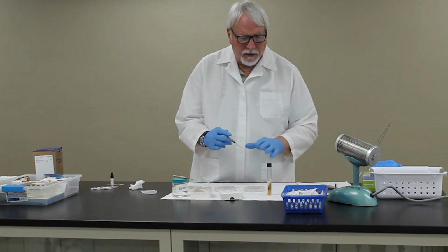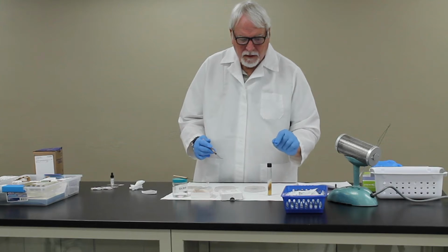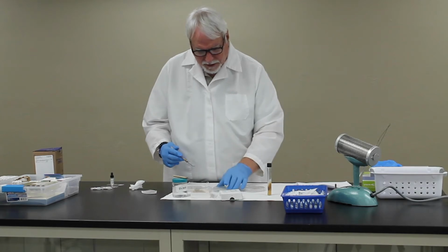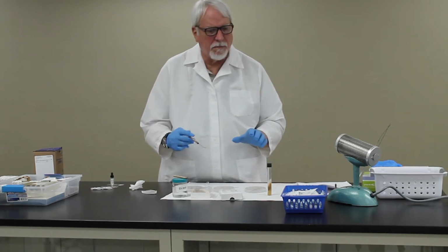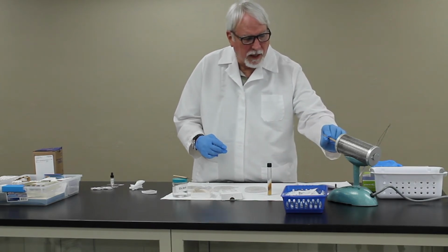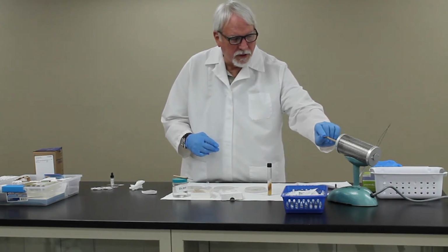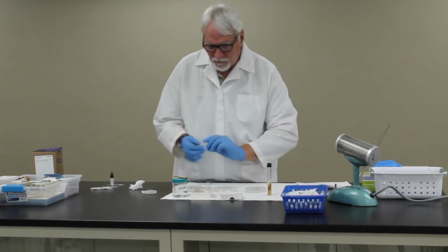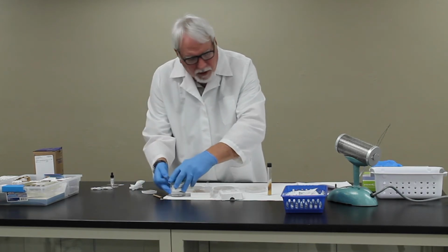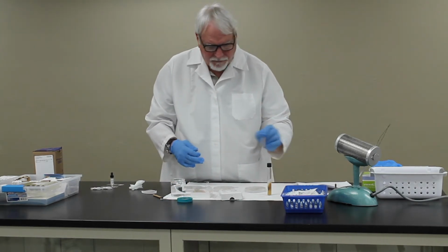Now, we don't handle the fungi like we do the bacteria. You don't streak the plates with the organism that you're subculturing to. So we're going to use this agar plate as an example of how you would transfer it. We're going to use a medium called DTM, which is a selective medium, which you'll have photographs of in your Moodle PowerPoints. So step 1 is to sterilize your loop, and we don't want to just hold it in the burner there until it gets super hot, because that would kill the fungus when you pick it up.